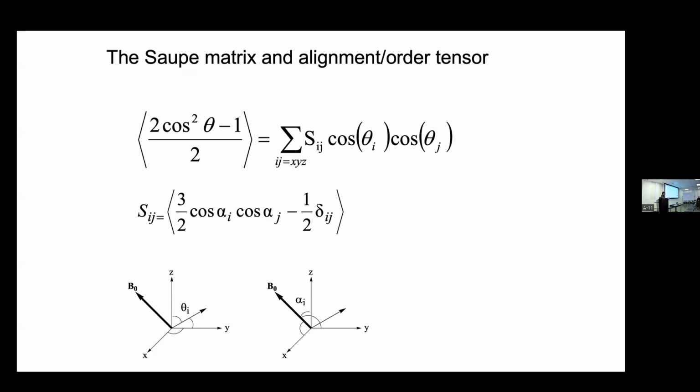So you have to have a clean buffer. Actually, Kurt Wüthrich came up to me at a poster when I had bicelles aligning protein when I was a graduate student. He saw these bicelles and looked at me and said, those bicelles are like jellyfish. I don't like that, because he thought that they were biting the protein. But the reality is that our buffers are extremely artificial.